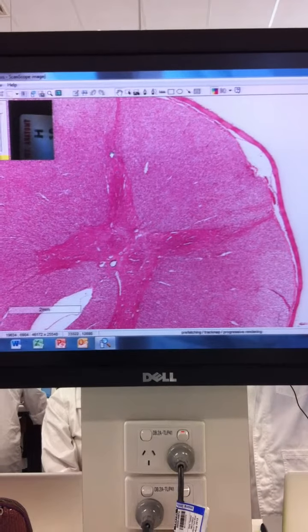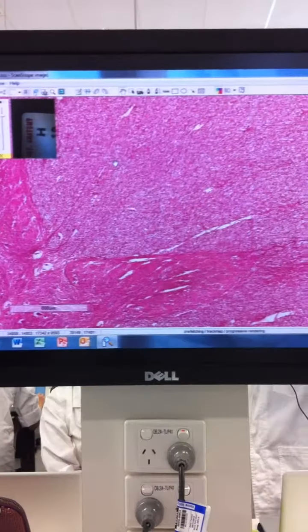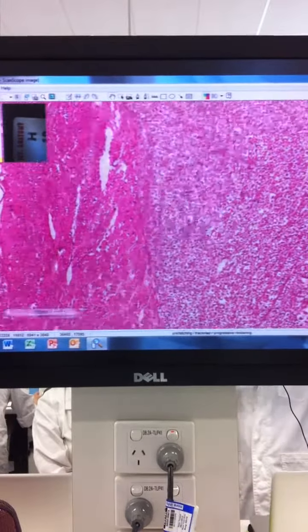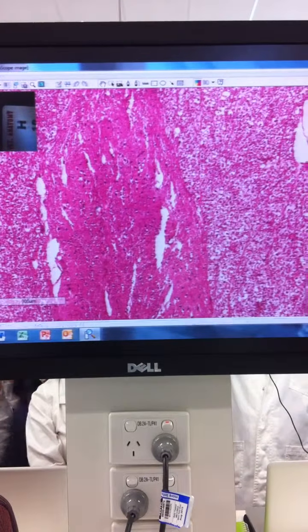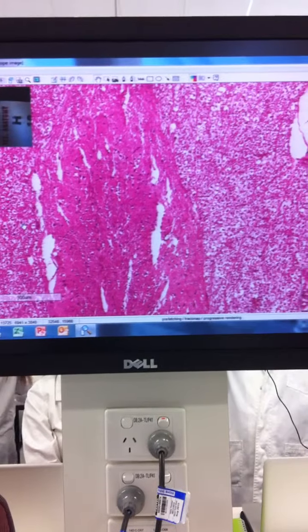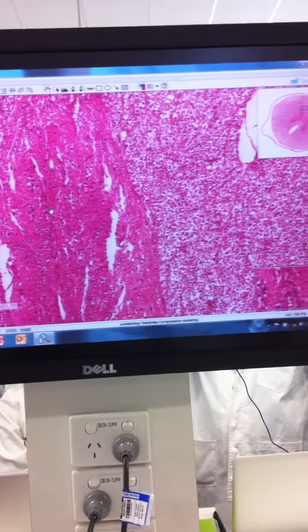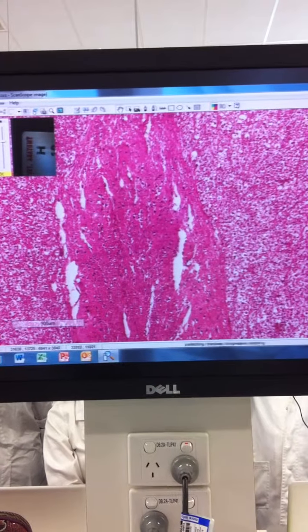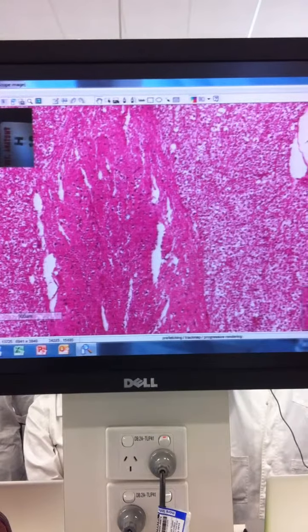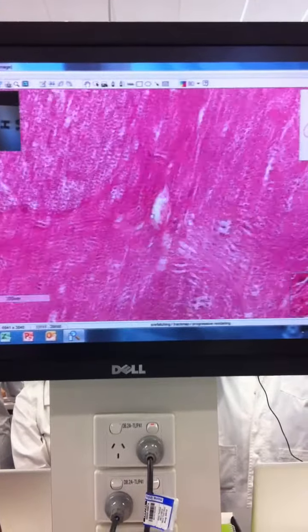Now I'll look at one horn here, dorsal horn. Remember the sensory nerves go into the dorsal horn. So this is the dorsal horn. It's grey matter as opposed to white matter. Remember that there are some cell bodies obviously in the white matter, and there are some processes in the grey matter, but it's the preponderance that makes its colour. Now if you look at this area here, remember that for a second, and we're going to go down to the ventral horn.